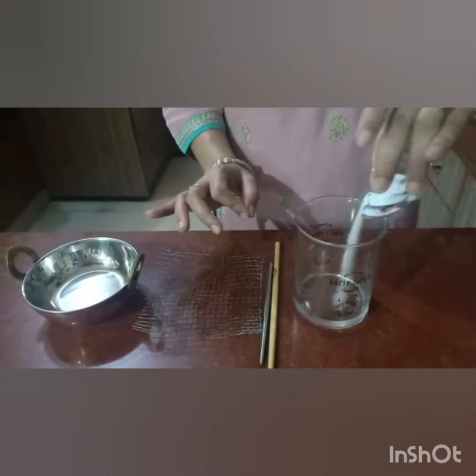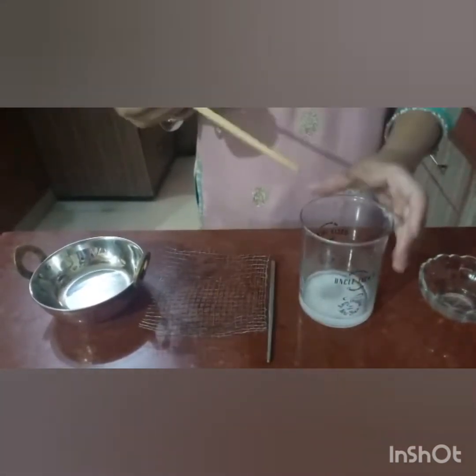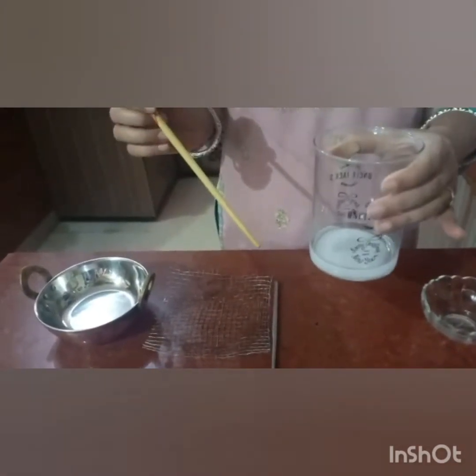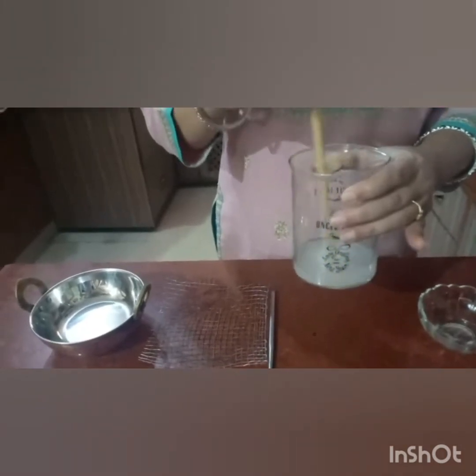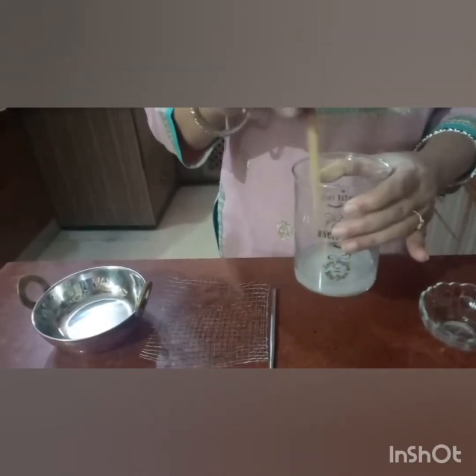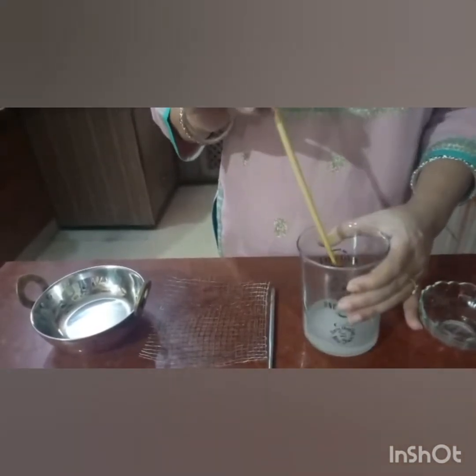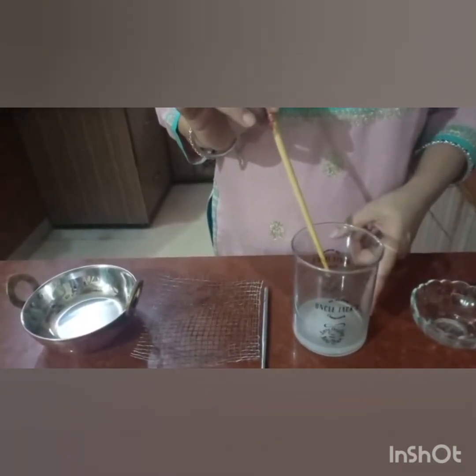So I will add the salt to water, and in this beaker I already have some water. So to this water I have added salt and stir with the help of the glass rod. I don't have the glass rod, so I am using this stick to stir and dissolve salt into it. Now children, what is a solution? A solution is prepared by adding solute to the solvent. So here in this case, salt was the solute, water was the solvent.